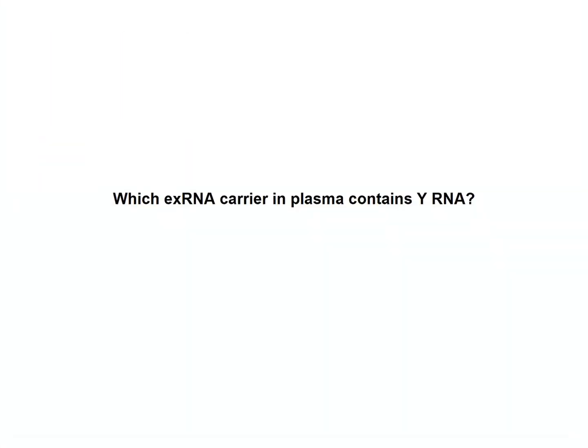So now back to our original question. Which extracellular RNA carriers in plasma contain Y-RNA? In order to answer this question, we used a combination of size and density-based separation methods.